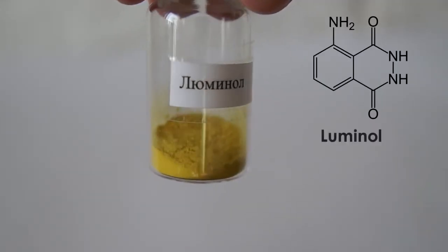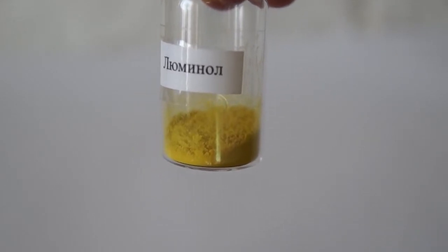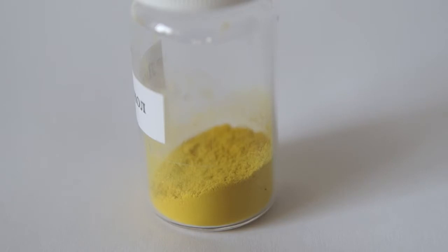Hello everyone! Today we'll conduct a very interesting experiment with an interesting substance called luminol. This substance will emit light under certain conditions.